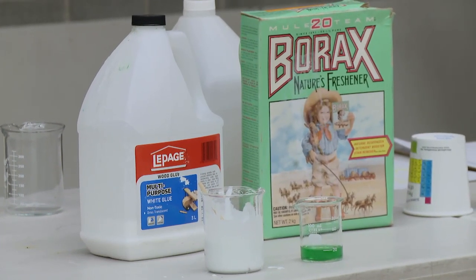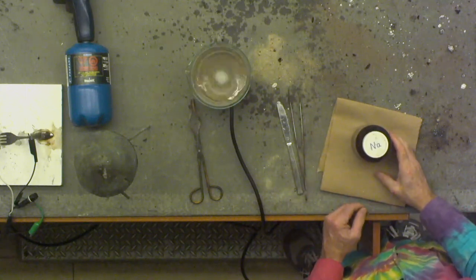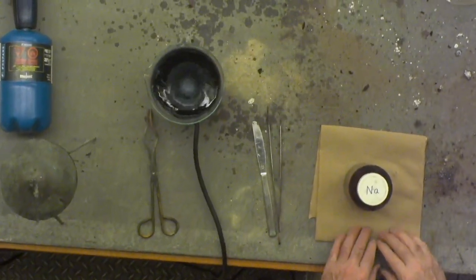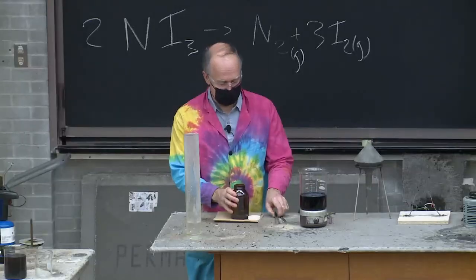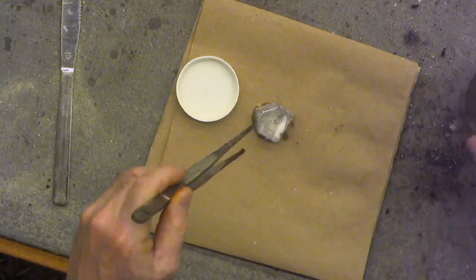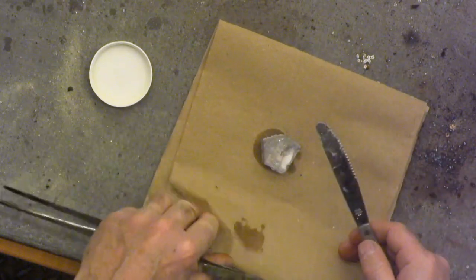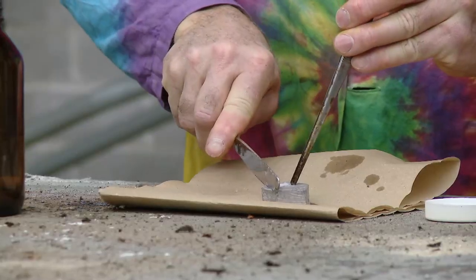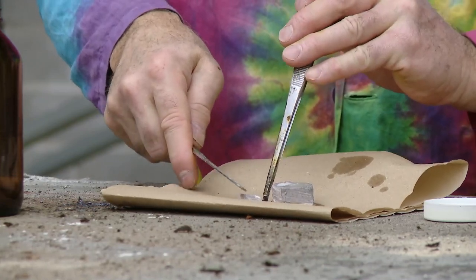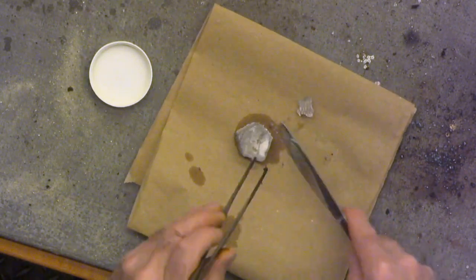What I have here is another explosion! On the overhead camera you can see a bottle labeled Na — you know that's sodium, down the left-hand side of the periodic table. These are very reactive elements. I'll take a piece of sodium metal out — it's kind of dull and gray, and we keep it under oil to keep it away from water. It cuts like hard butter. You can see that nice shiny surface — sodium that hasn't oxidized or been exposed to oxygen or water.